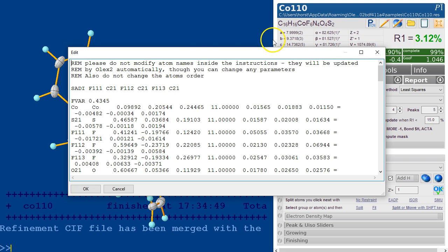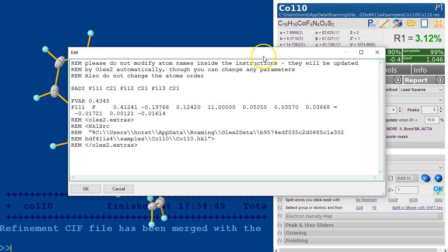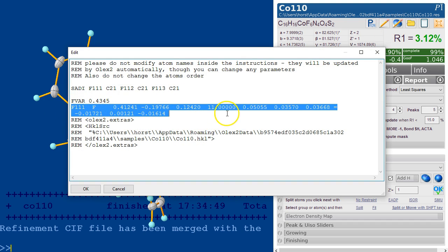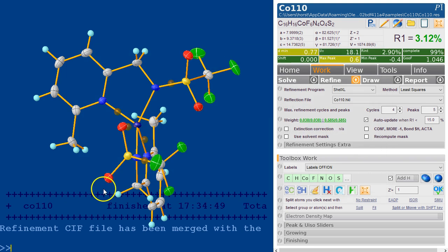And this one shows you the atoms in the file in a sort of ShellX type representation. The difference here, of course, is if we select nothing, you get all the atoms. And if you only select one atom, like I've done here, and I just show this again, you see only this one atom. But everything that we know about this atom, for example, the fact that there is a SADI on it is also displayed. So all the dependencies, everything that depends on that atom is also shown.